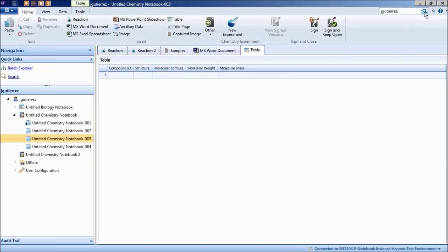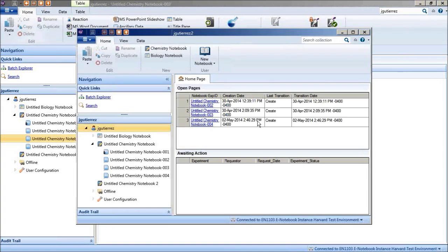You can go directly to the collection by Alan. Okay, and it will get you directly over there. So no need to open the search, just use the search collection on the top.